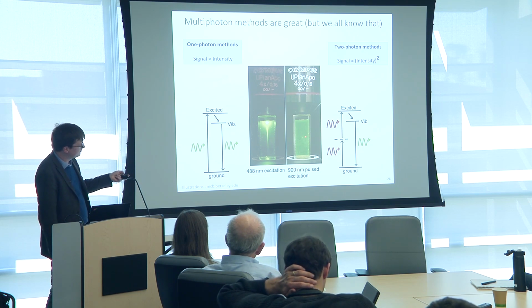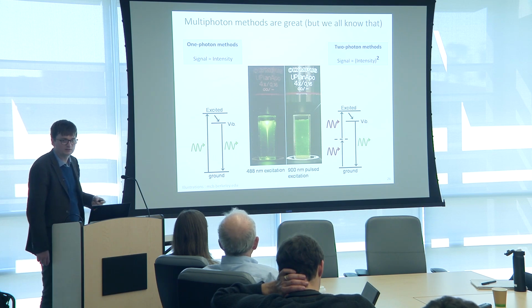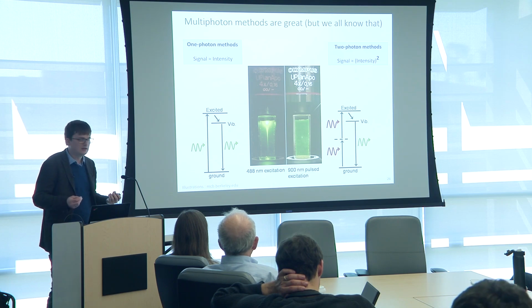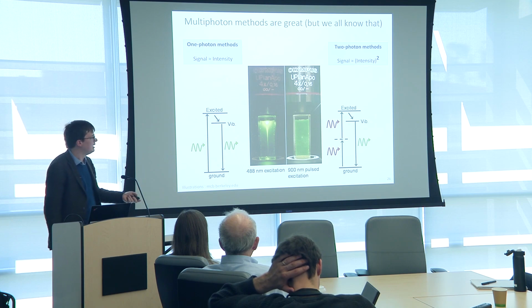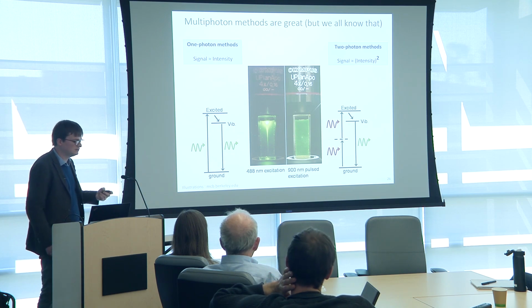Here, what you can see in this 2-photon experiment is that we have the ability to confine light very, very well. The reason for that is that the statistics of absorption of 2 photons at the same time is proportional to the square of the intensity, while for single photon absorption, the response of the material is very linear. For every photon you send in, the probability of absorption is about the same. And when you go to a multiphoton process, what matters is the square of the intensity.